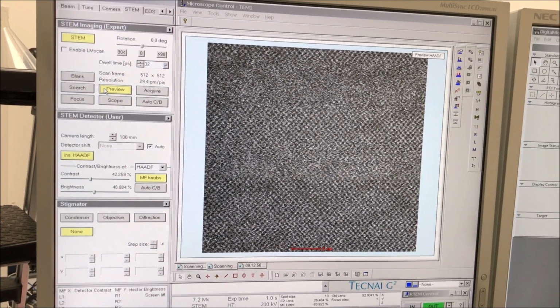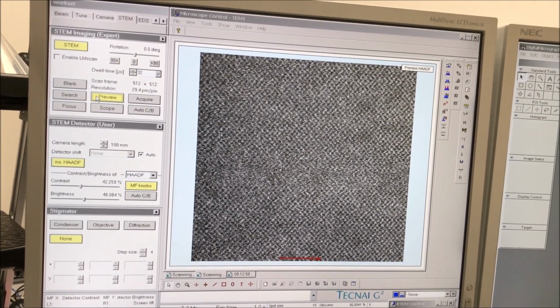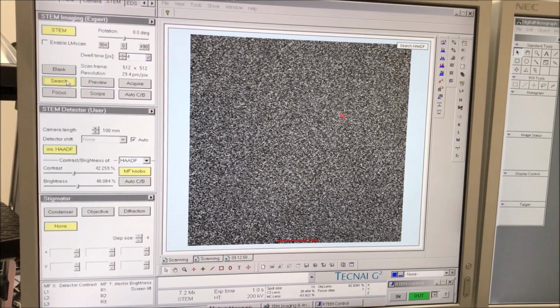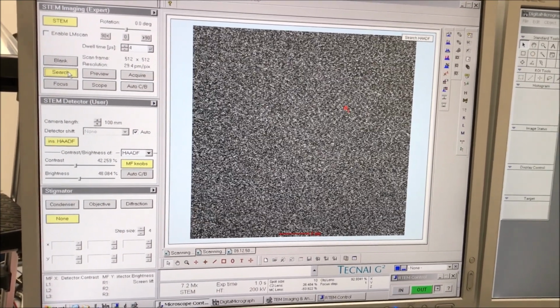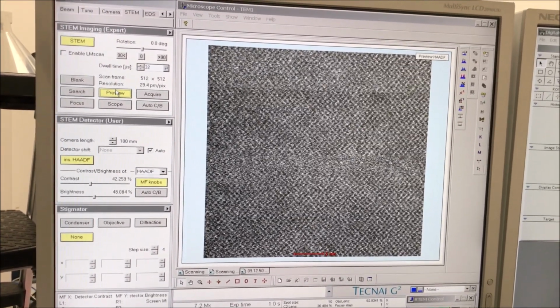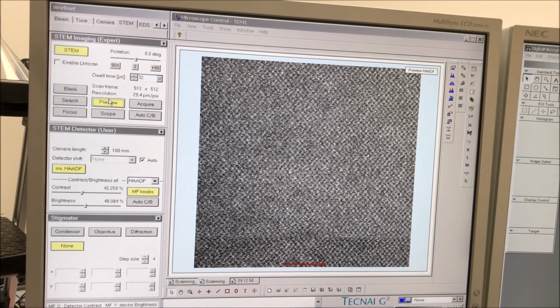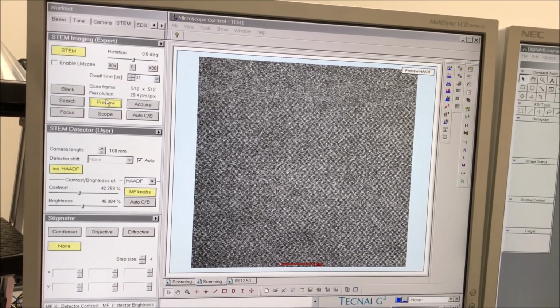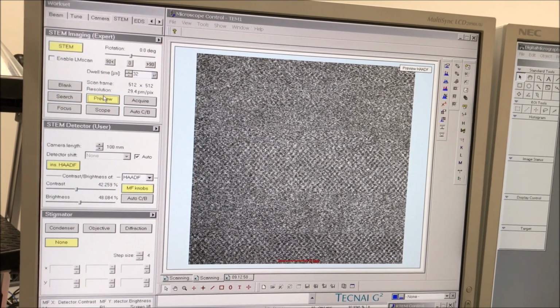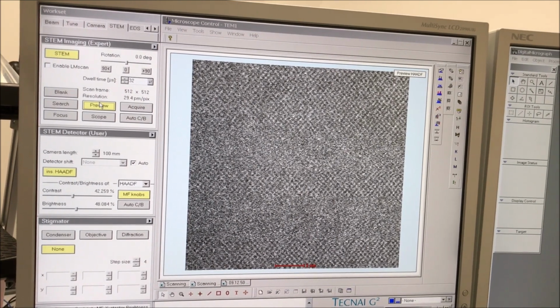Obviously every time I talk it vibrates. This area hasn't been contaminated that badly yet, but over time I'm going to see the same problem, and in fact you can see it happening right now. I'm losing the detail. It's slowly going away. The contrast I was seeing, those nice, well-separated features, are going away. And this obviously is bad because you don't get a nice image.